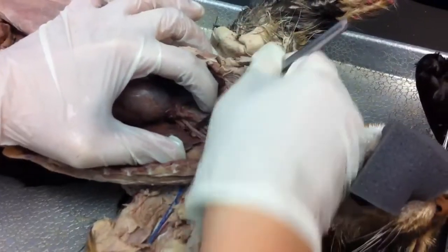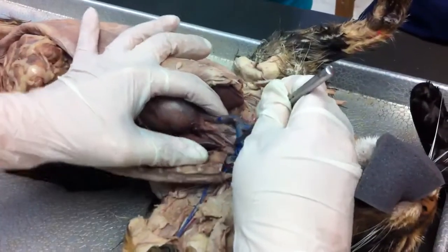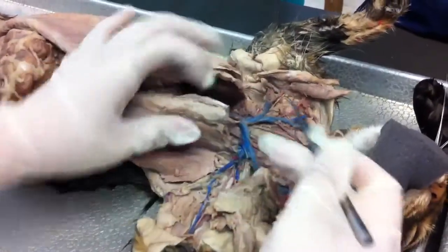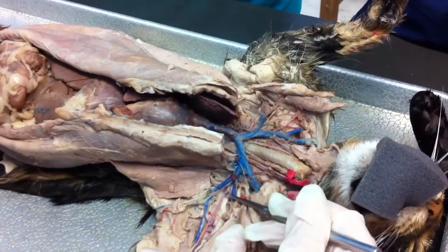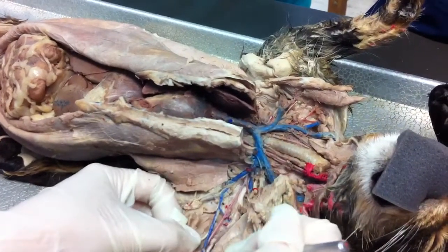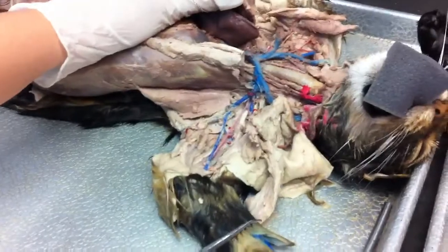Now let's follow this left subclavian. It comes up and it ends right around where the rib cage ends, like right in there. So like I said, you fold up the arm, you could kind of imagine the left axillary artery just like your Axe deodorant, you put it in your armpit, left axillary artery, and then left brachial when you get out to the arm. Okay, so that's it for the upper on the cat.